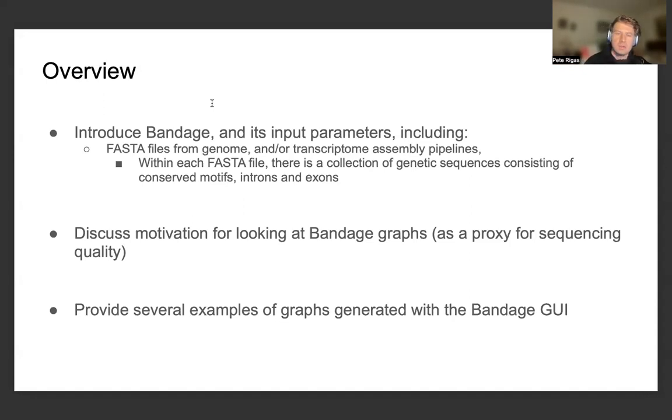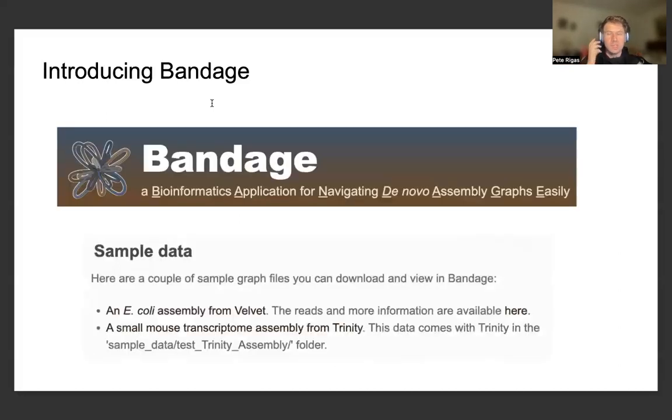To inform our discussion, we'll be providing several examples of graphs generated within the Bandage GUI. There's also a way to implement Bandage in the command line, but for our beginning purposes, it's easier for people who are just getting used to this to use the graphical user interface, which allows someone to directly input the FASTA files into the application.